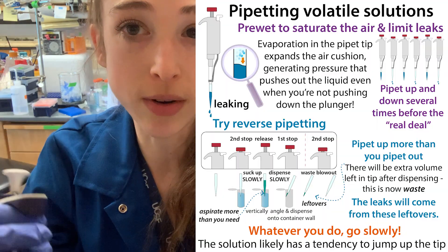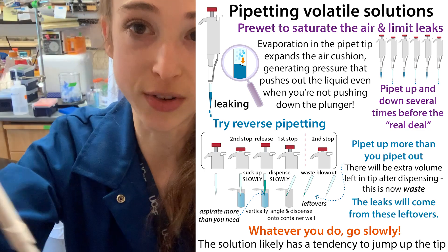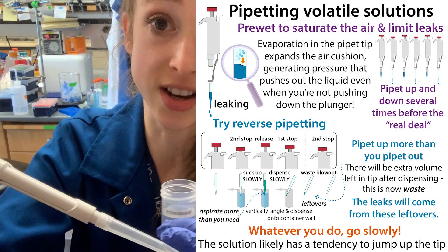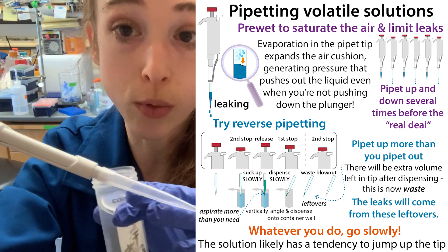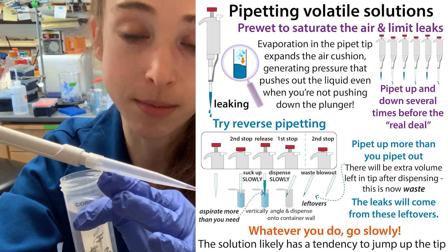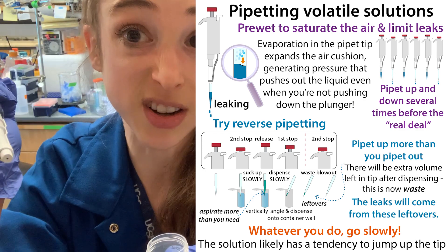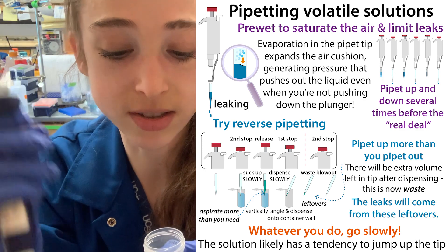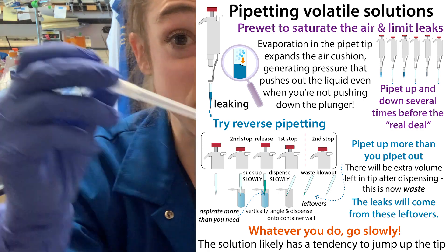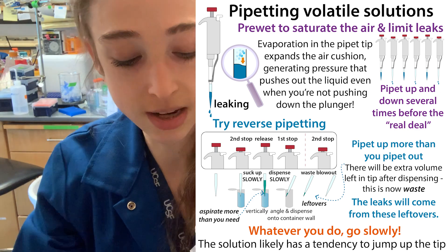This is a big issue if you're doing something like a miniprep, where the wash buffers often have ethanol in them and you're doing a bunch of tubes quickly — going up and down fast and it kind of just squirts back up. You want to avoid that splash-back not just to prevent drops on the side of the tip, but also so it doesn't contact the plunger, because there could be gunk on there that the ethanol will dissolve and get into your sample. If you're using a filter tip, you'll clog up the filter, which messes up your volumes and causes all sorts of problems.